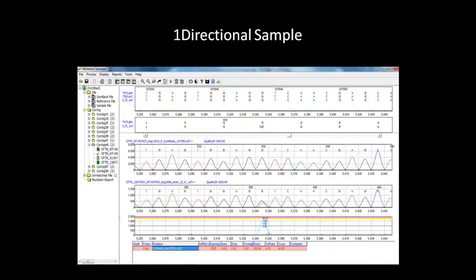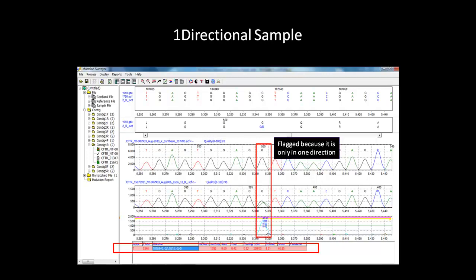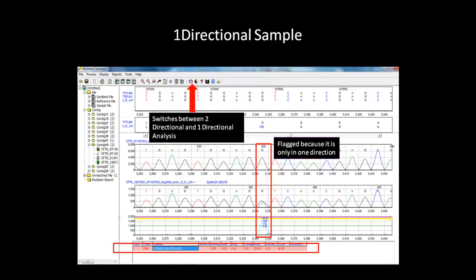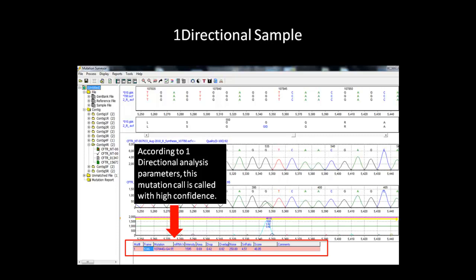This dataset contains 2D samples, but one of the samples did not align correctly due to the quality of the sample. It is flagged as low confidence in the mutation table with red font because it is only called in one direction, but it is subjected to two directional parameters. You can switch to 1D parameters at any time by clicking on the icon shown here. The software will now apply one directional parameters to the mutation call. The variation text is now color coded blue for high confidence. You can then confirm this mutation and add a comment to let yourself know that this mutation is called with high confidence under 1D settings.